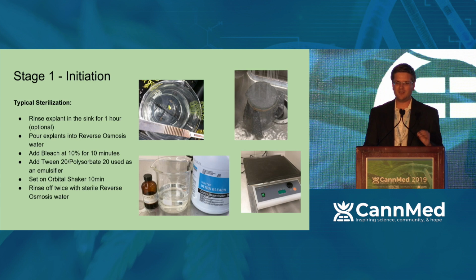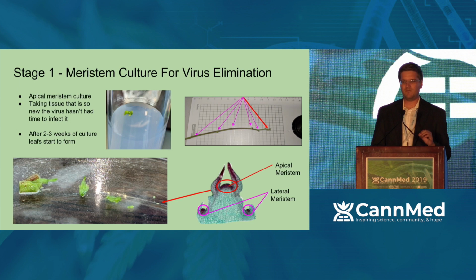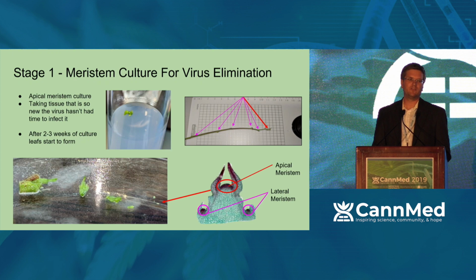So you got to talk about two different forms of stage one tissue culture, at least in cannabis. There's actually a third that's called callus culture. I'm not even going to go into that because, as far as I'm aware, very few, if anybody, has developed a protocol where you can get shoots, or indirect organogenesis, so shoots to form from callus culture. We're going to go on to meristem culture, which is taking a meristem. You can see, let's see here, highlighted in that red bubble here, you can see a meristem. There's lateral meristems and apical meristems.